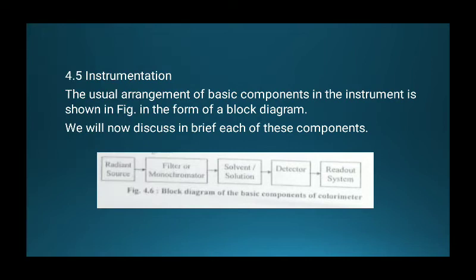In the previous section, we have seen the deviation from Beer's law, absorptivity, and factors governing various measurements, that means temperature, solvent, wavelength, etc. Now today we are going to discuss the instrumentation.